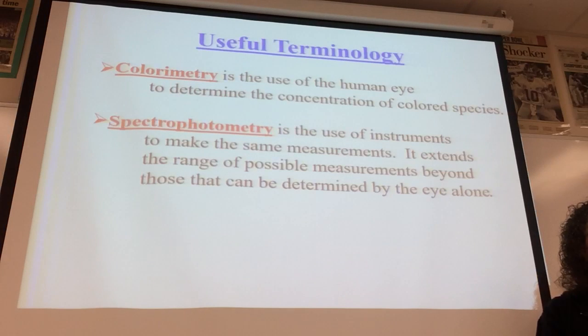Or, I hate to use this example, but it's perfect. When you go to the bathroom in the morning, it's a yellowy orange color, and then after you've had a lot of water to drink, it's not nearly as yellowy, right? So the darker the color, the more concentrated the solution, provided that you're comparing the same substance dissolved in solvent, typically water.